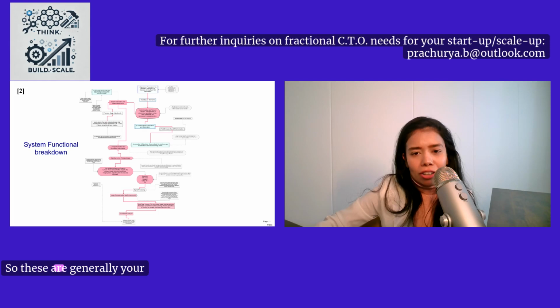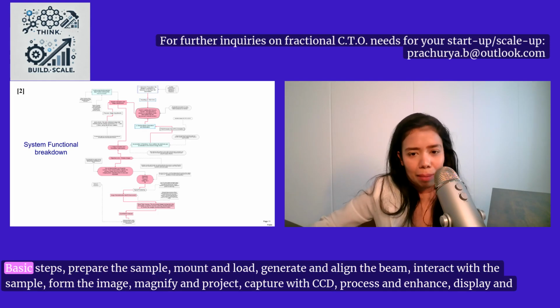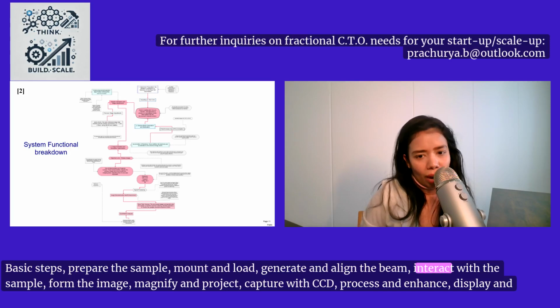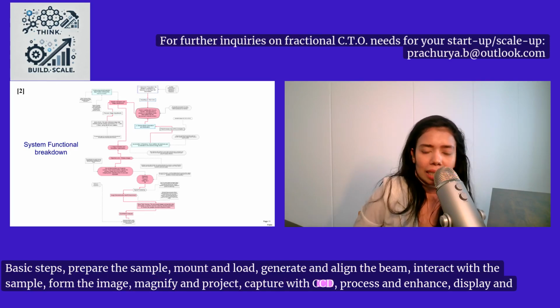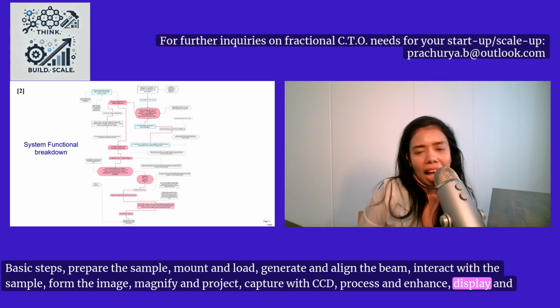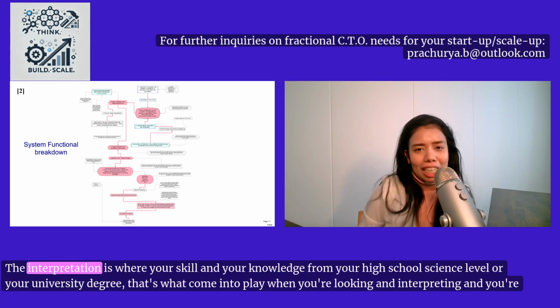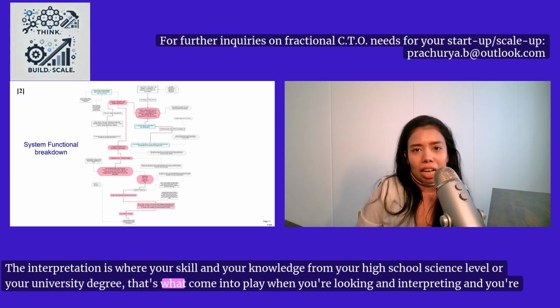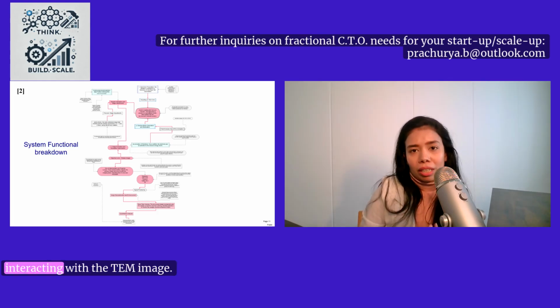So these are generally your basic steps. Prepare the sample, mount and load, generate and align the beam, interact with the sample, form the image, magnify and project, capture with CCD, process and enhance, display and interpret. The interpretation is where your skill and your knowledge from your high school science level or your university degree come into play when you're looking at and interacting with the TEM image.